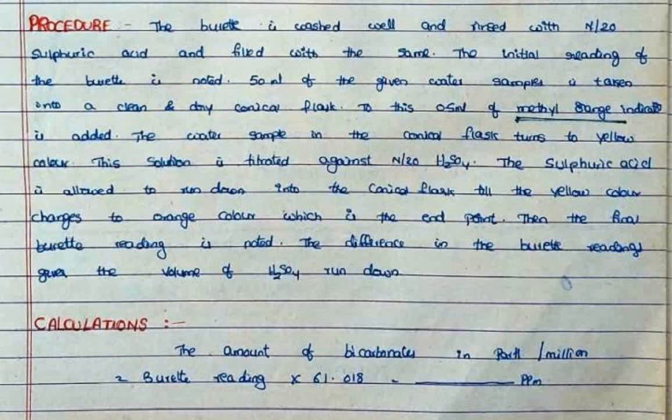The difference in the burette readings gives the volume of sulfuric acid run down.